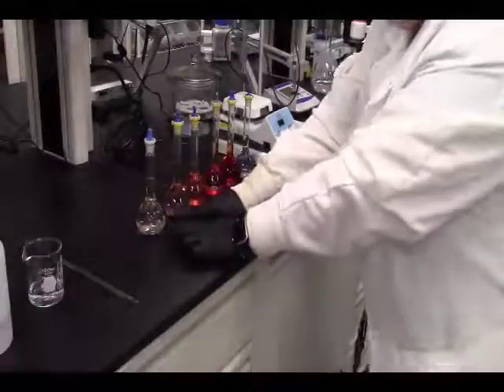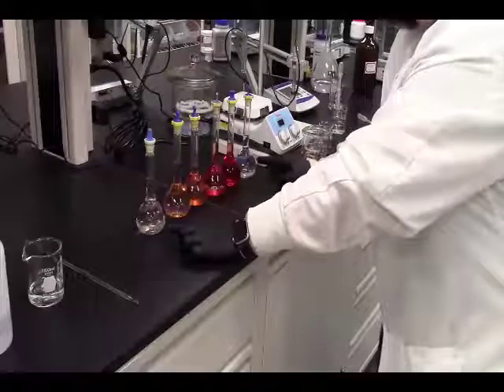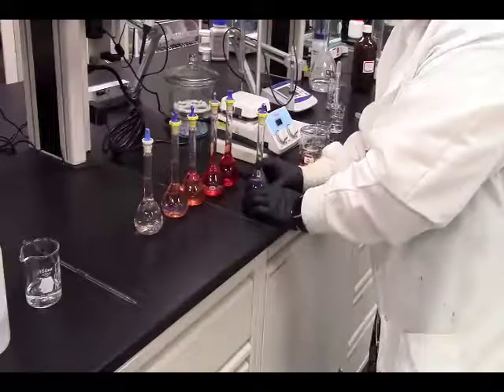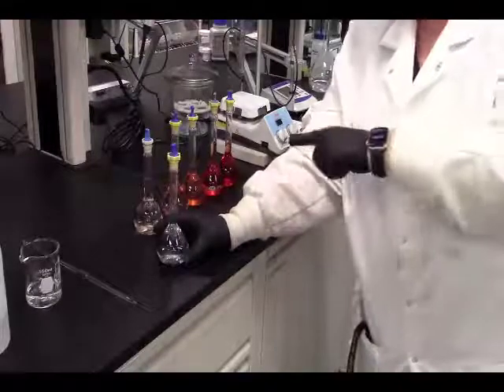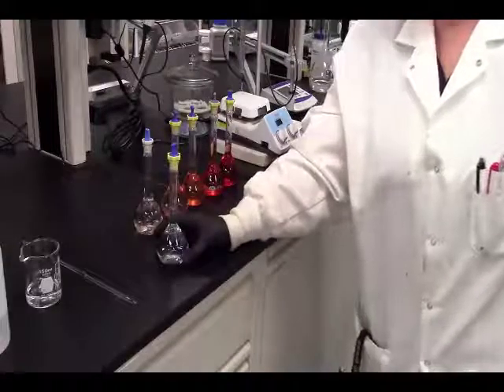And this is what your standard series should look like, from least concentrated to most concentrated, and our blank. Our blank was made up with distilled water, the same amount of orthophenanthroline, hydroxylamine, and sodium acetate. And you should have that as to why we did that in your lab report for your discussion.